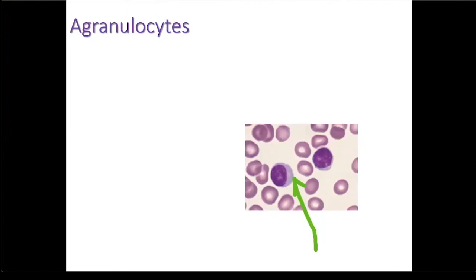Now let's look at the agranulocytes. Recall that they don't have visible granules when they are stained. Their cytoplasm looks a pale blue.